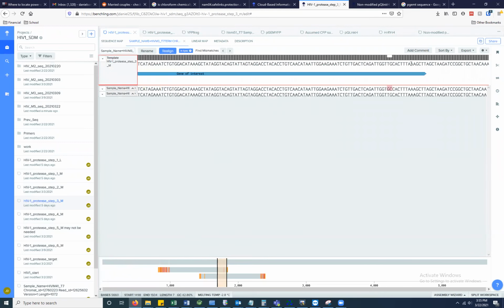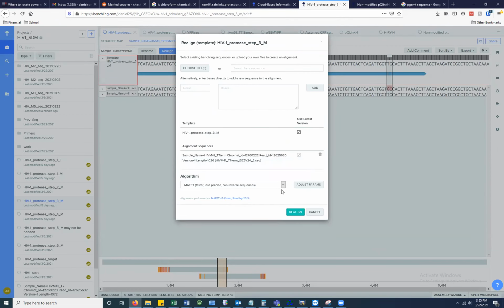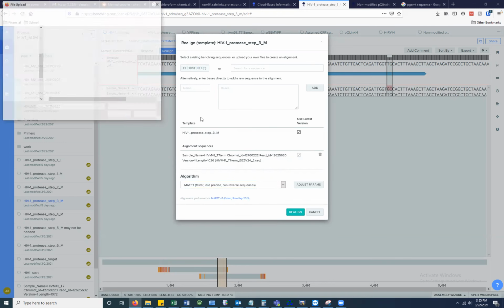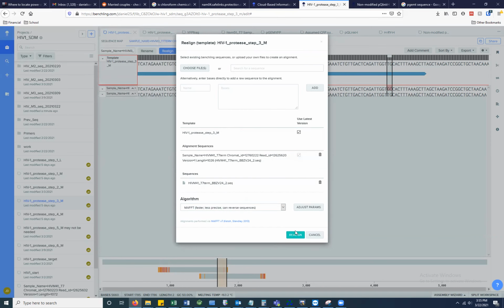Here, this is what red dots look like. And so if I had both at M4, I guess I can realign with both M4. Right, we're not expecting this to fit, but as an example. M4 terminator, then I have two terminators.